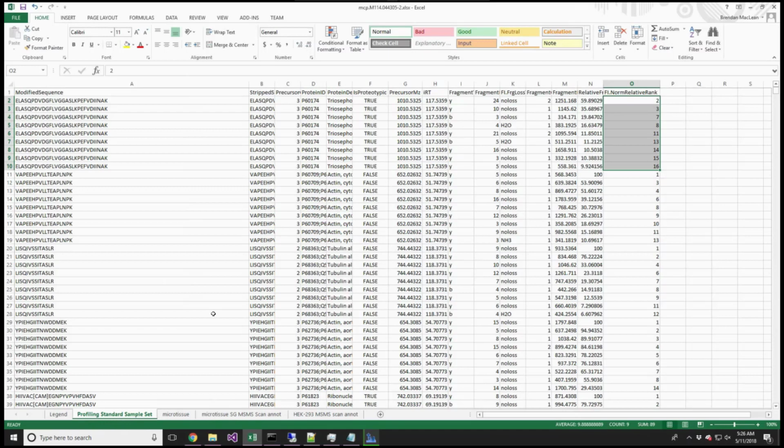I'm working with... Yeah, actually, we're having an MCP standards meeting the day after ASMS this year. We worked with Steve Carr over at the Broad Institute to form a new standard for targeted proteomics, when you're doing SRM and PRM, anything where you're choosing your targets before you measure.